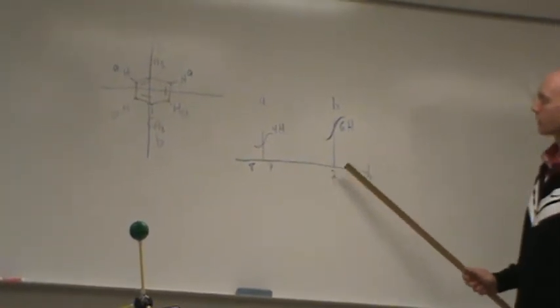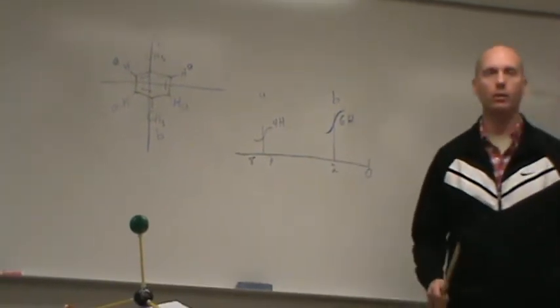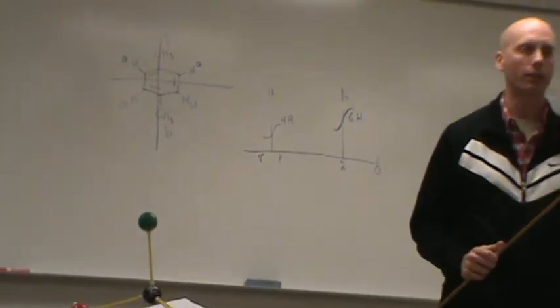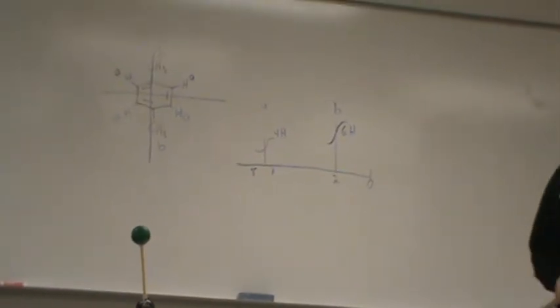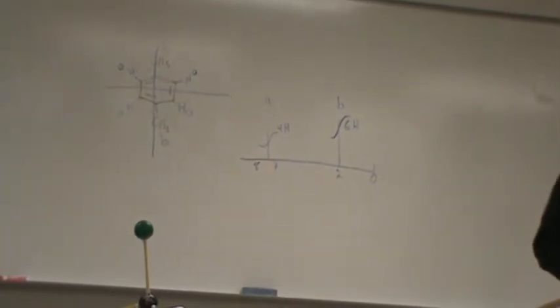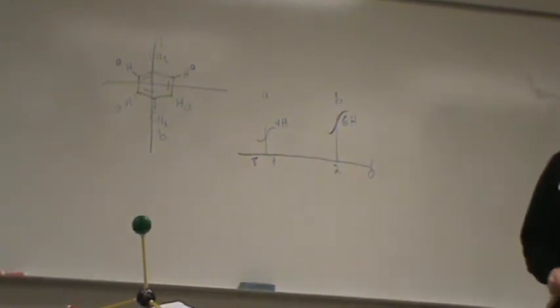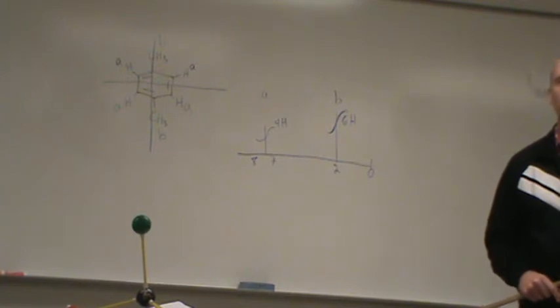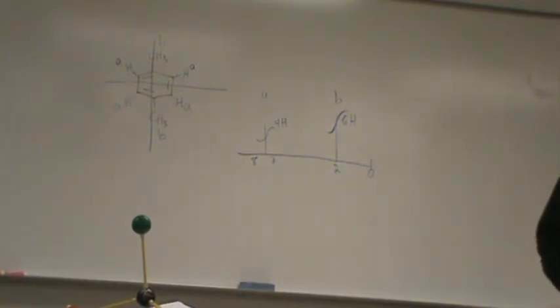Okay? So the more deshielders you have, it would even get higher, given some of the examples we saw last time. Okay? So any questions on how we did this one here? Hopefully it's starting to make a little bit more sense. You see how you have to use those 3 rules. Use them over and over so you don't miss anything.